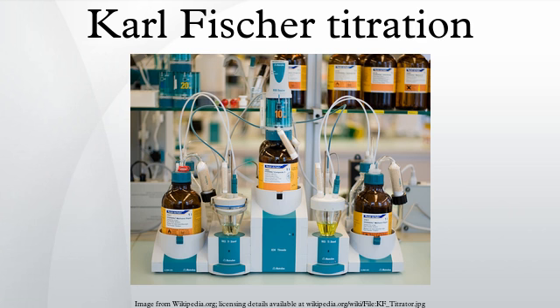Volumetric titration: the volumetric titration is based on the same principles as the coulometric titration, except that the anode solution above is now used as the titrant solution. The titrant consists of an alcohol, base, SO2 and a known concentration of I2. 1 mole of I2 is consumed for each mole of H2O. The titration reaction proceeds as above, and the endpoint may be detected by a bipotentiometric method as described above.